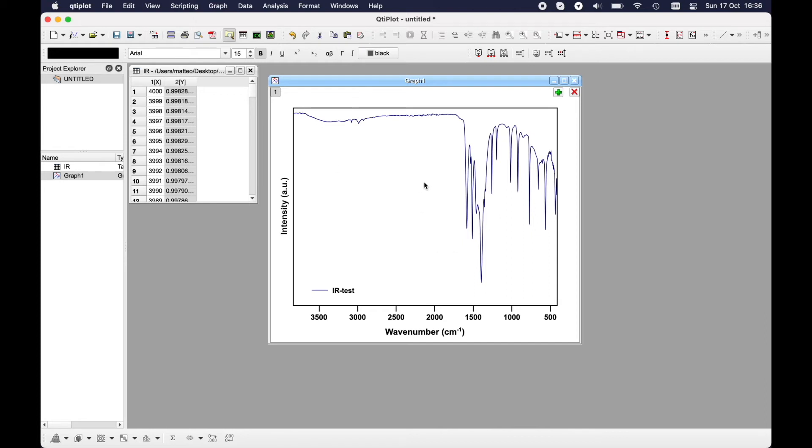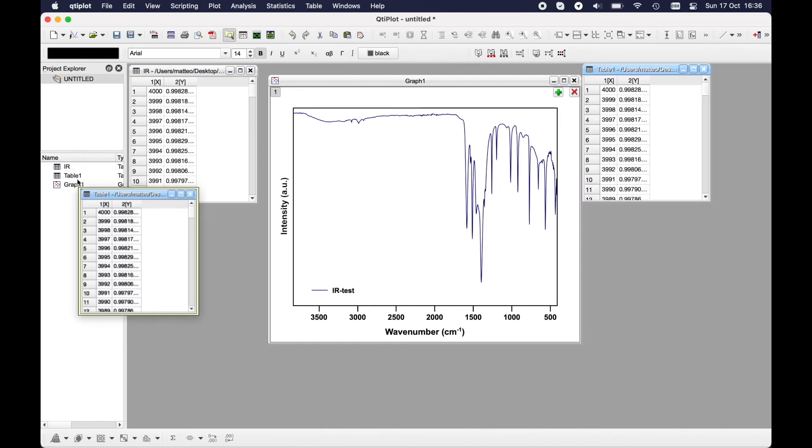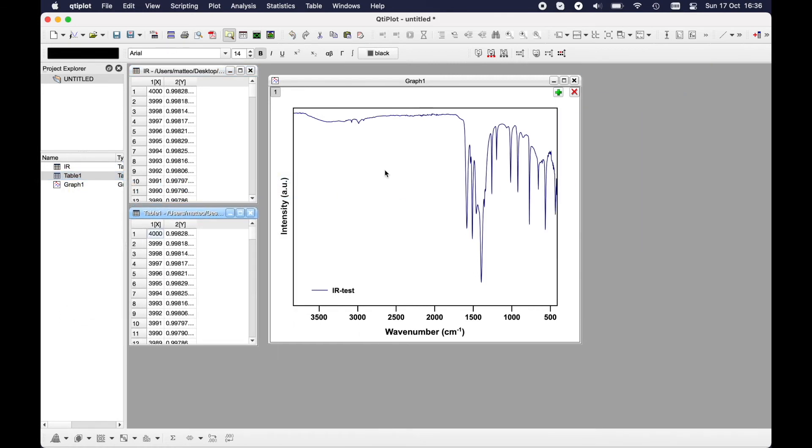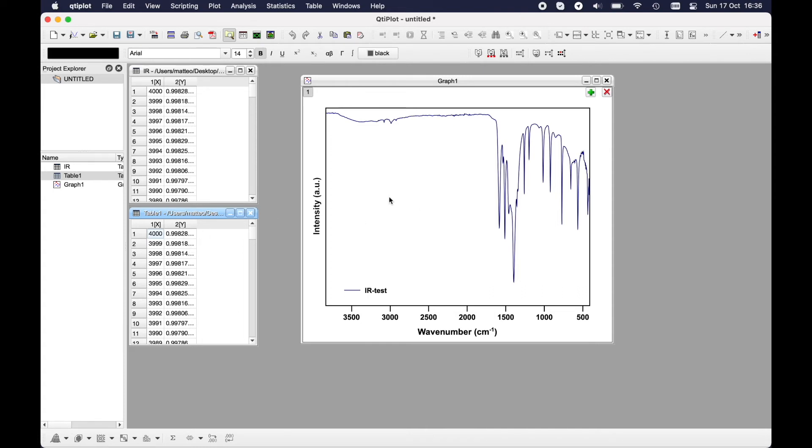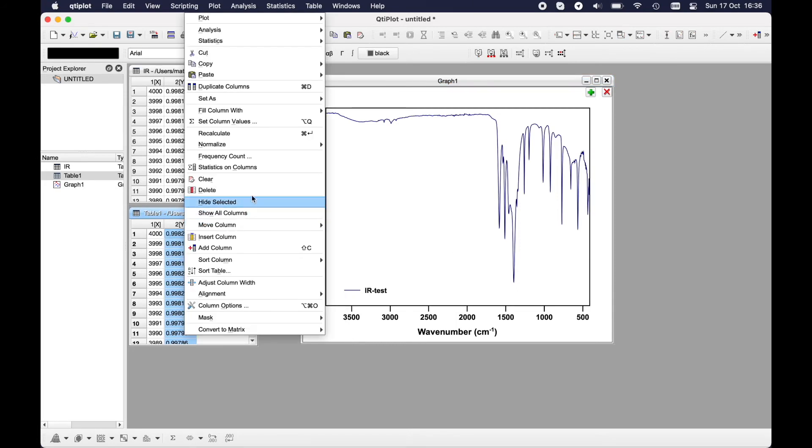But let's say you would like to put another spectrum inside over this for comparison. You might for example import another file. In this case I just copy this one. And let's say you did all the operations as before with this new spectrum, so you have normalized it to see from zero to one.